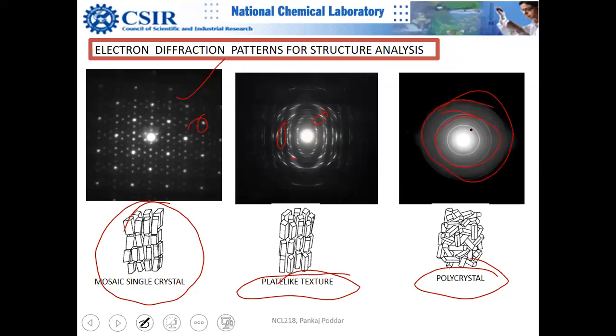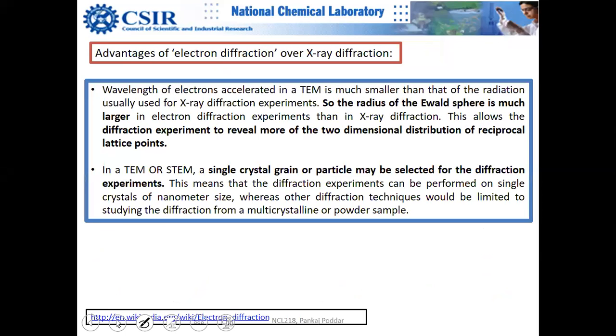But you can still use it. It's very useful. You can again calculate the diameter, and it will tell you the... Okay, so advantages will end in 2-3 minutes. Advantages of electron diffraction over X-ray diffraction.